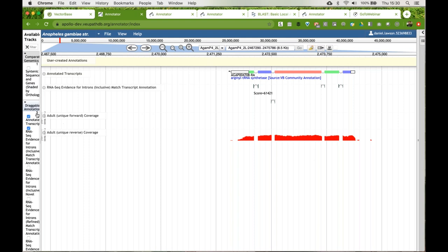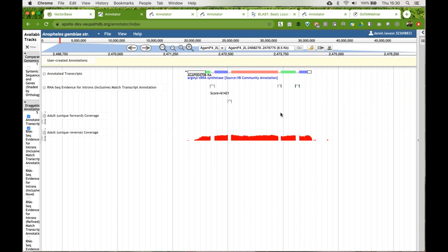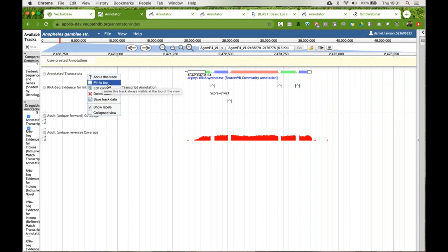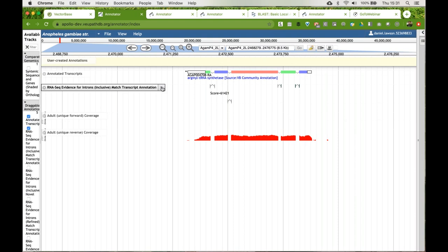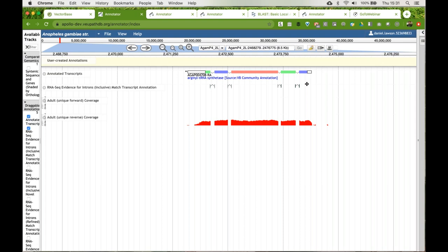The tracks available here are synchronized with the tracks available inside JBrowse, so you can look at them here or in the main site. The tracks are all configurable — once you've turned them on, you can highlight the track and there's a drop-down menu. It allows you to get more information about the track, pin it to the top of your screen, collapse or show labels. Collapsing literally reduces the amount of screen space used by the track.